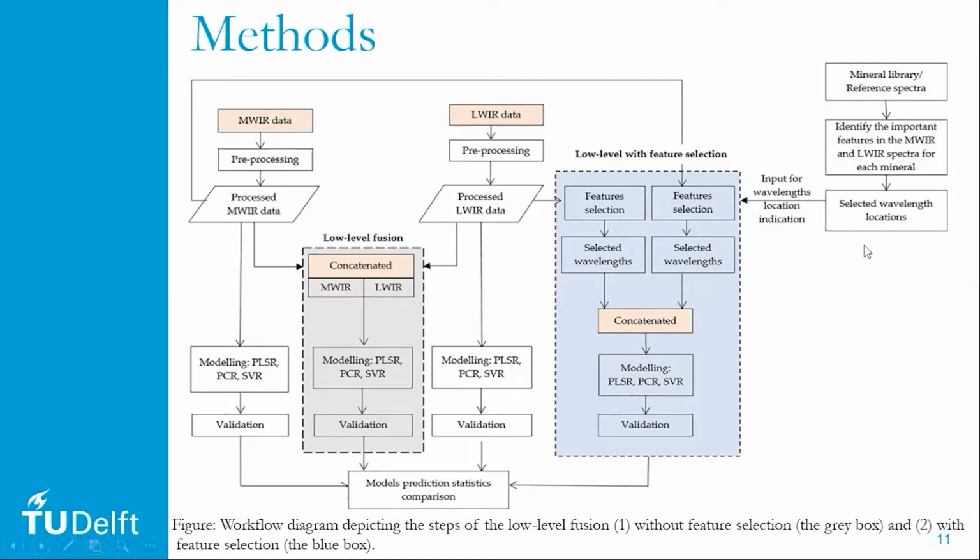So relevant information was extracted from the two data blocks separately. Then the extracted features were concatenated to form a single data matrix. Then prediction models were developed using the fused data blocks and different models. Then once the models were applied for individual and fused data blocks, the results were compared to see if the prediction accuracy is improved after data fusion. And the result is, of course, validated using independent data sets.